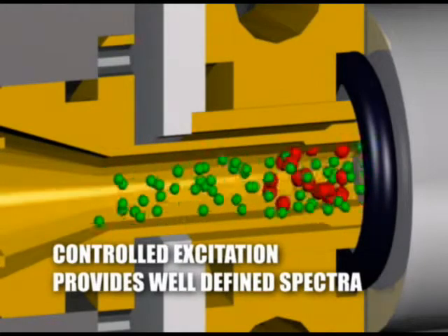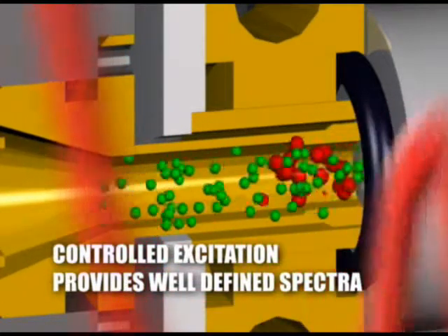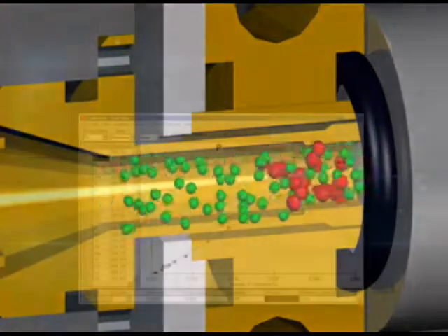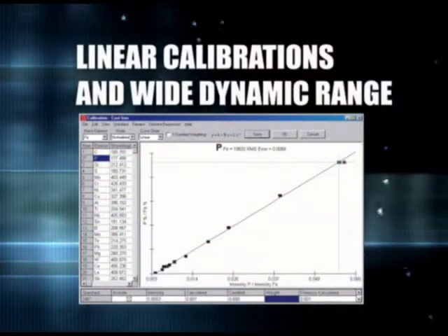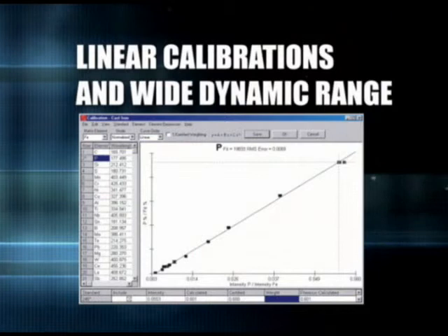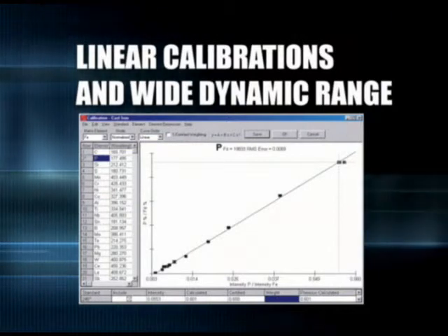The intensity of the element spectra is directly related to the concentration of the element in the sample. This controlled excitation provides well-defined spectral lines, allowing for linear calibrations and a wide dynamic range.